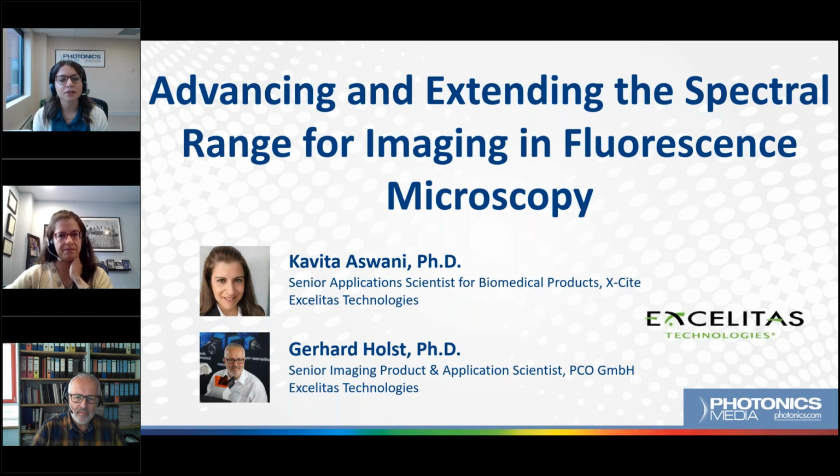Dr. Holst is the Senior Imaging Product and Application Scientist at Excelitas PCO GmbH. And Dr. Aswani is the Senior Application Scientist for Biomedical Products at Excelitas Technologies X-Cite. In this session, they are going to discuss the advances in fluorescence illumination and detection in biological microscopy.